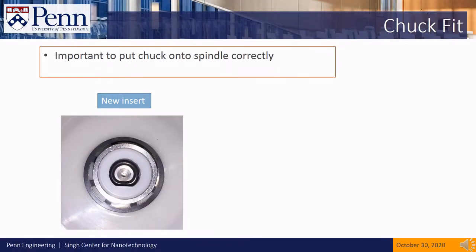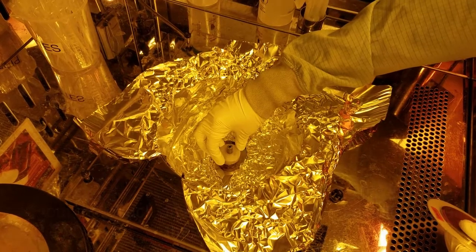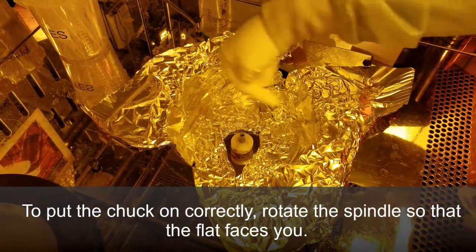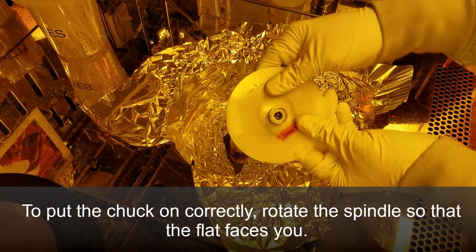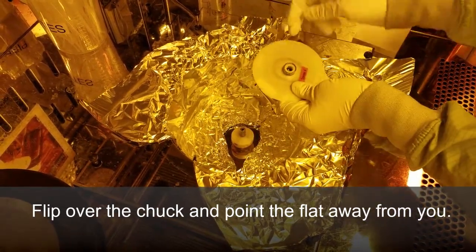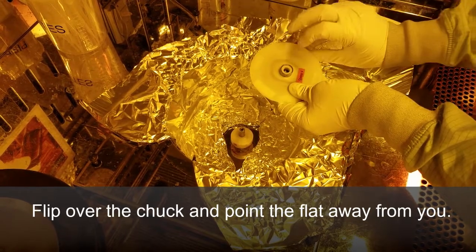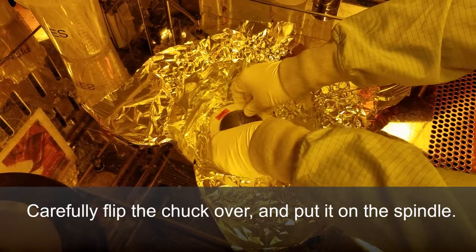The chuck must also be put on correctly; otherwise, the insert will get shaved down and become unusable. To put the chuck on correctly, rotate the spindle so that the flat faces you. Flip over the chuck and point the flat away from you, then carefully flip the chuck over and put it on the spindle.